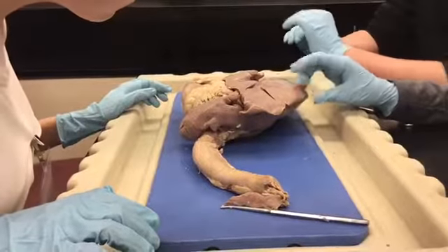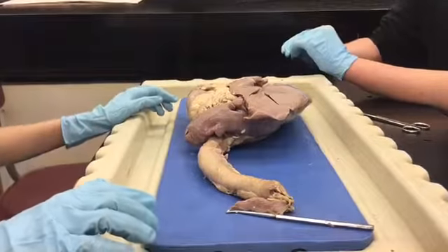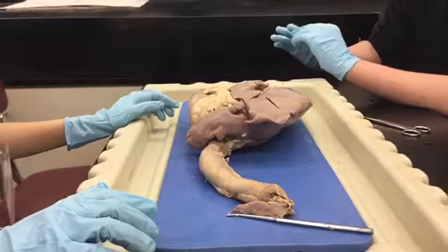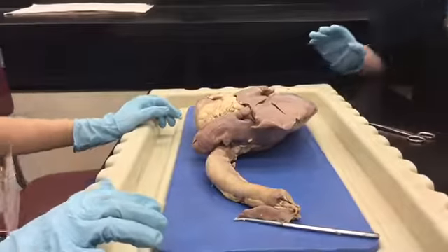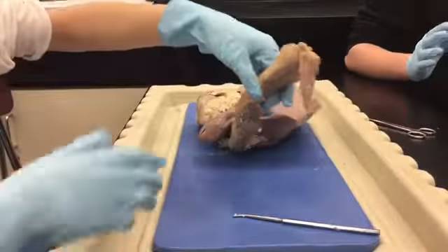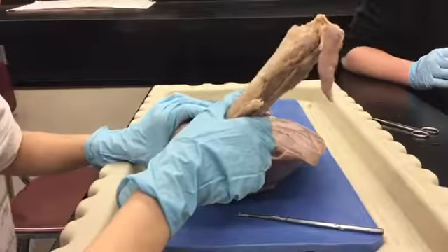Alright, let's take a moment and identify what we're looking at. I'm going to pick one up over the tray so it doesn't drip, because I dripped last period. This is the trachea, and some of you have extra tissue, some of you have almost none. This is a trachea. You hold it up right here.